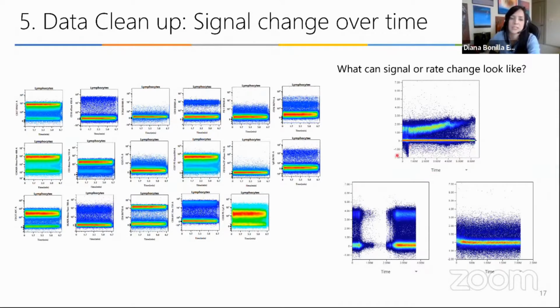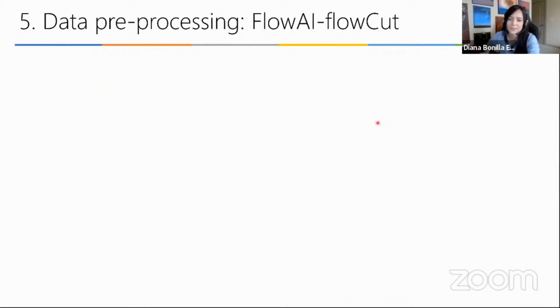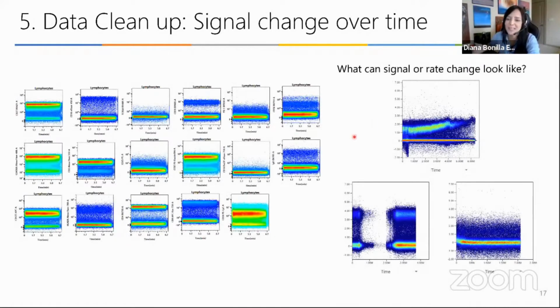So make sure you take the time to review that as well. So doing this manually for one sample, it might be doable, but it's definitely not effective for large size or for small chips like this one, where you cannot simply gate out the good parts and exclude the bad ones. It's really difficult.